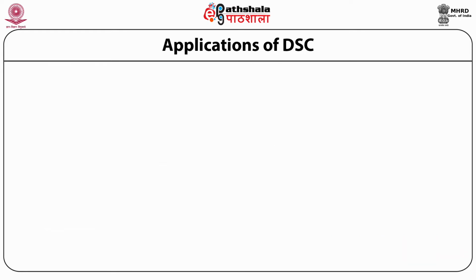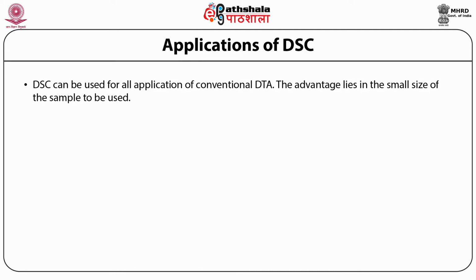Applications of DSC. DSC can be used for all applications of conventional DTA. The advantage lies in the small size of the sample to be used in comparison to DTA. DSC essentially studies the thermal phenomena as DTA does, albeit using a different principle.